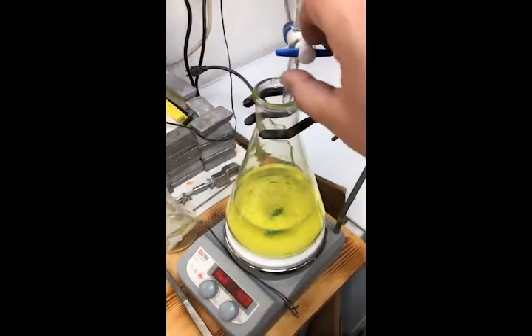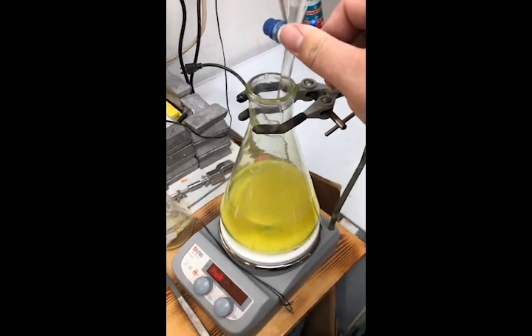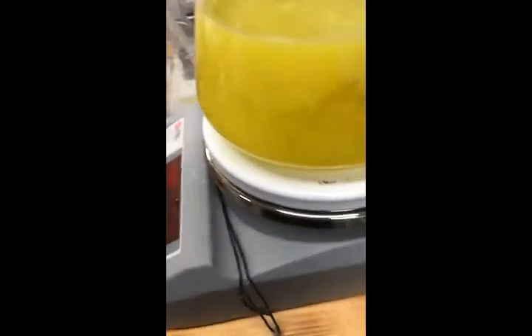The heating is stopped and excess ammonium hydroxide is added to precipitate the uranium as ammonium diuranate. The stirring is stopped and the flask is removed from the hot plate to cool.